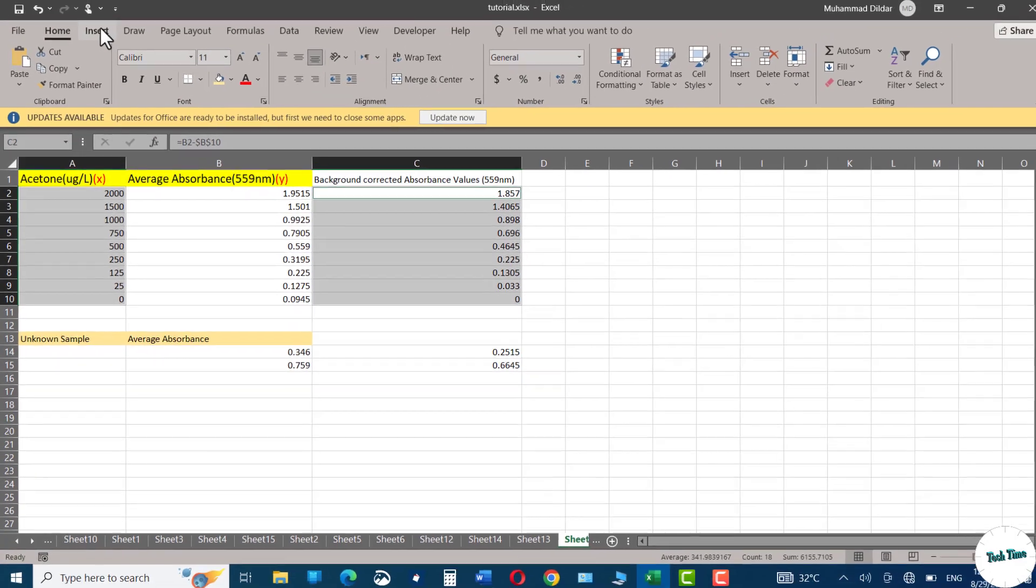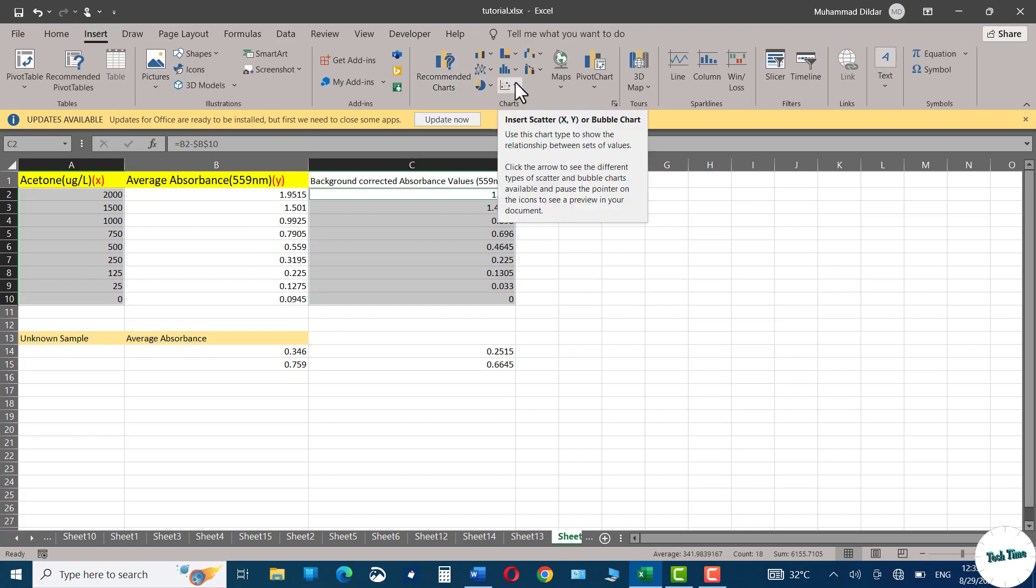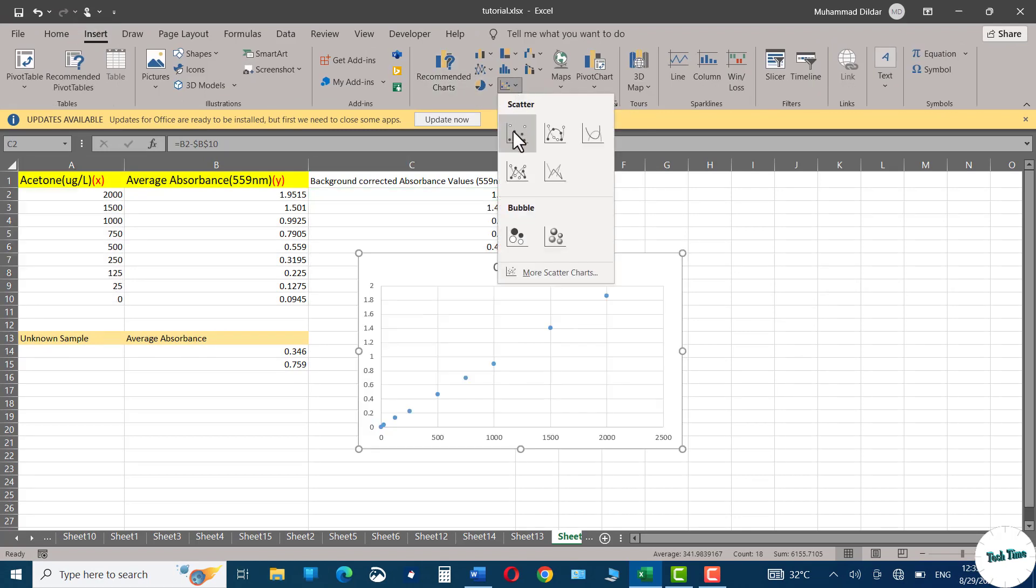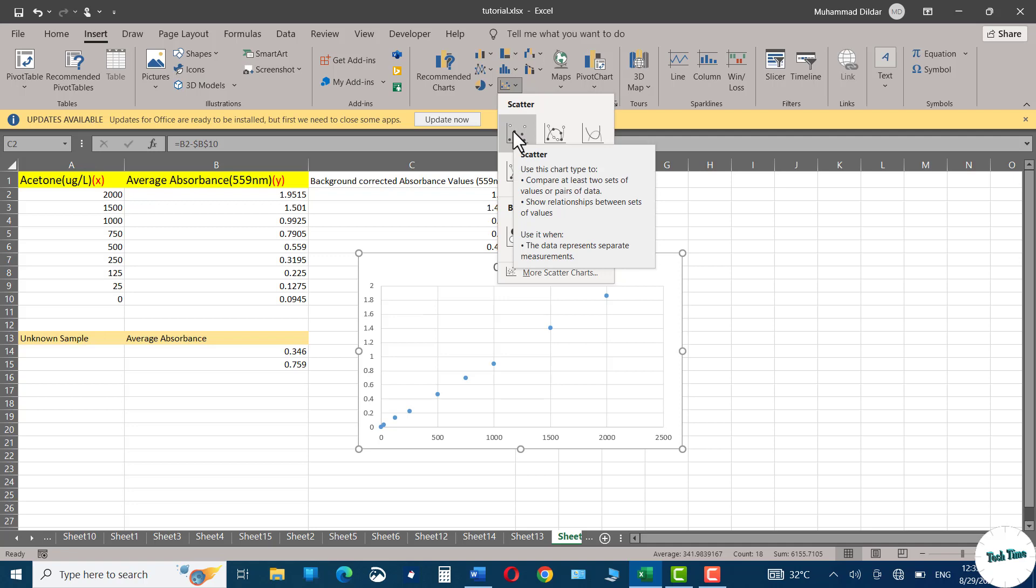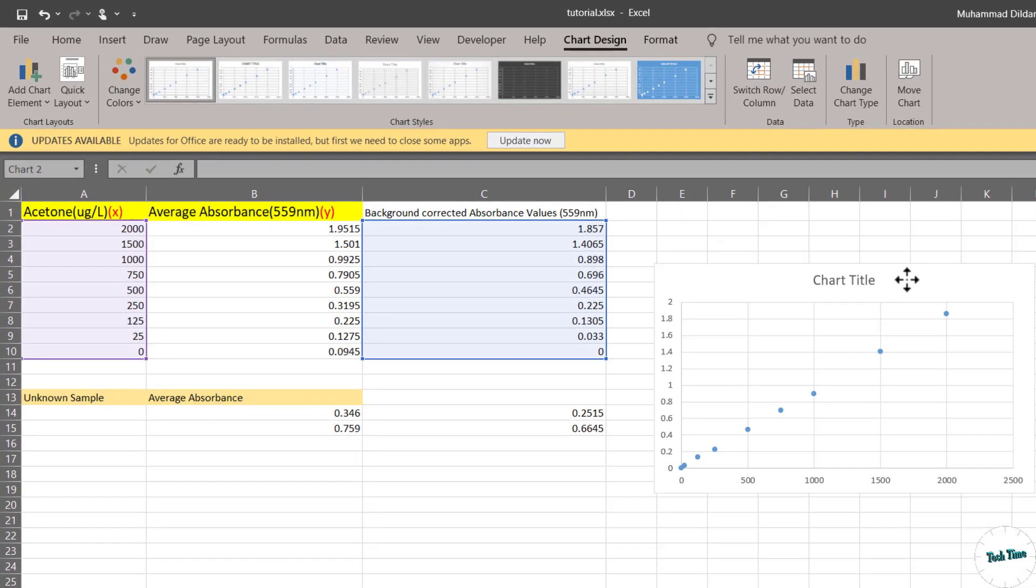Next, we will go to insert tab and in the chart section, you can see we have this option scatter chart. Choose this particular one and there we have our chart.